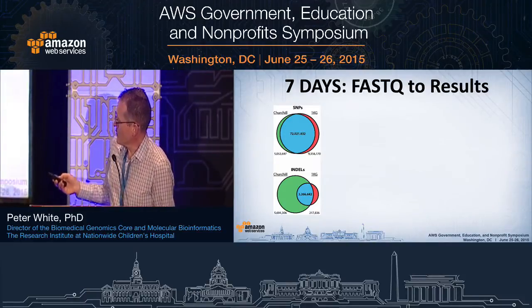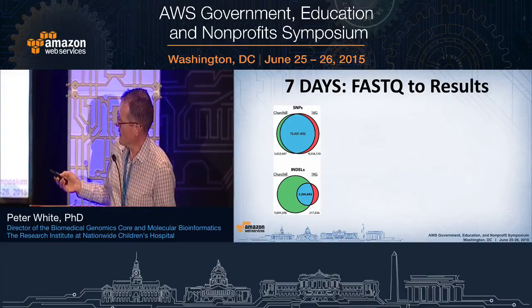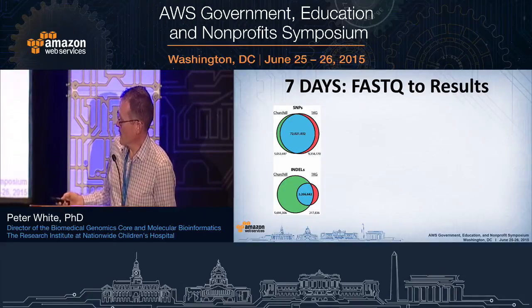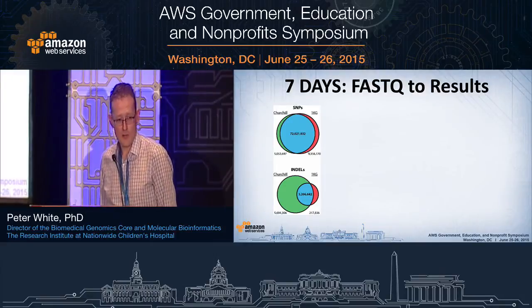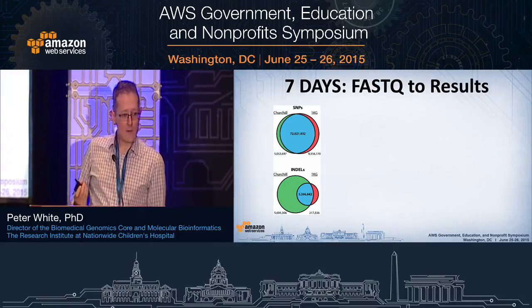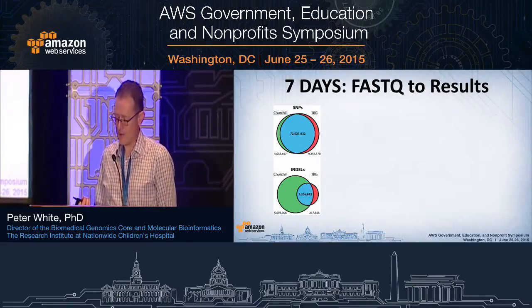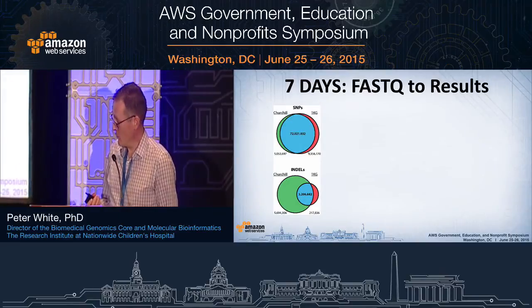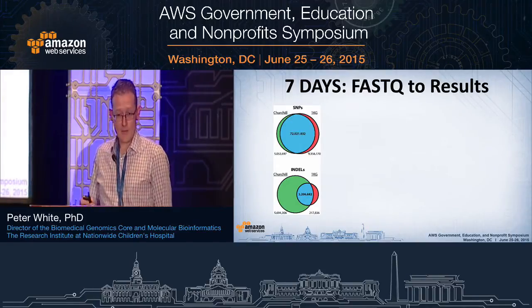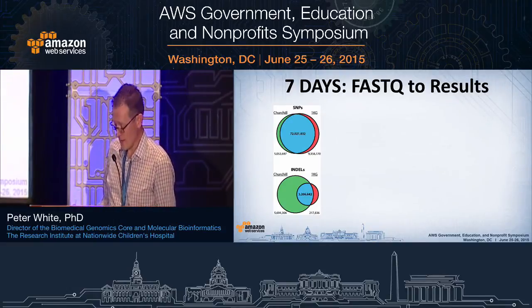For the SNP calls, we had a high degree of overlap between the calls that Churchill made and those identified by the Thousand Genomes. For the indel calls, we actually discovered just over 5 million indels that hadn't been reported by the Thousand Genomes. And we think this was because we used a more sensitive algorithm for doing the indel calling. And when we look at some of the validation rates of this data, we are seeing a high level of validation of these indel calls.